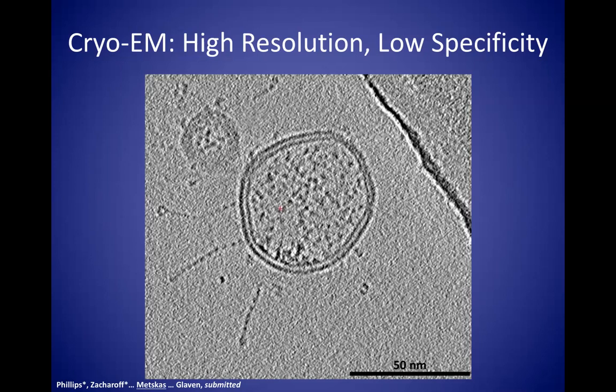target. So we collected a lot of tomograms of these outer membrane vesicles, and you can see that they're about 50 nanometers in diameter, and they contain a variety of proteins. And unfortunately, they do not contain the ultrastructure that we expected to see. We know the protein's present, but we have no way of targeting it because we cannot easily, from the EM alone, tell where it is.